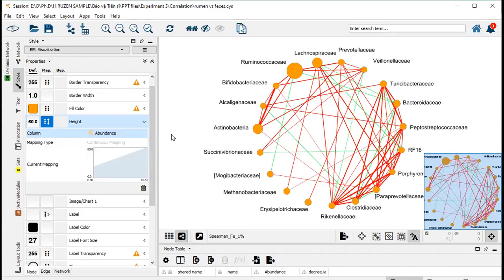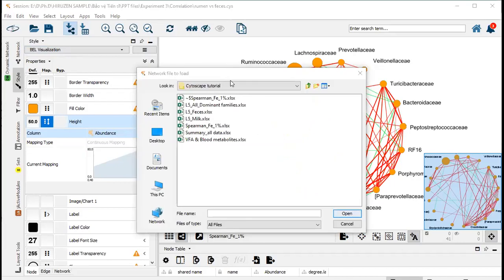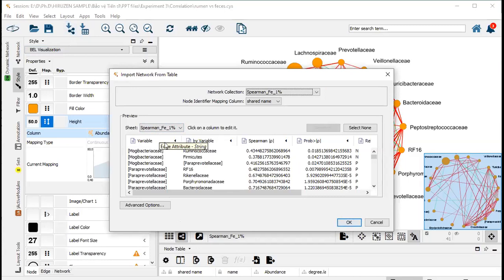That is target inside, to see the last part. Could you clarify? The last part about the relative abundance. No, to see the target. Okay. Okay, I will choose again for Spearman here. Spearman. For here, right?